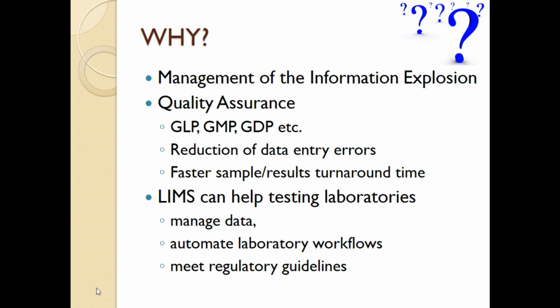So why implement a laboratory information management system within your manufacturing site? And I suppose one of the main reasons is to manage the vast amount of data or information that's generated in all areas of manufacturing, as well as in the sample analysis arena. So it allows for greater quality assurance over areas like good laboratory practice, as well as good manufacturing practice and good documentation practice throughout the life cycle of your sample.